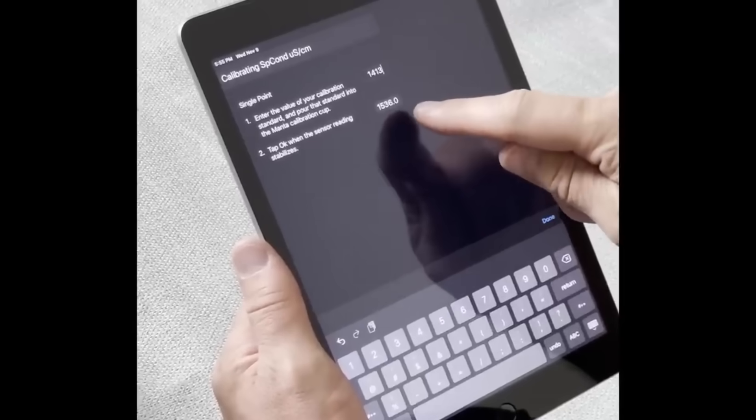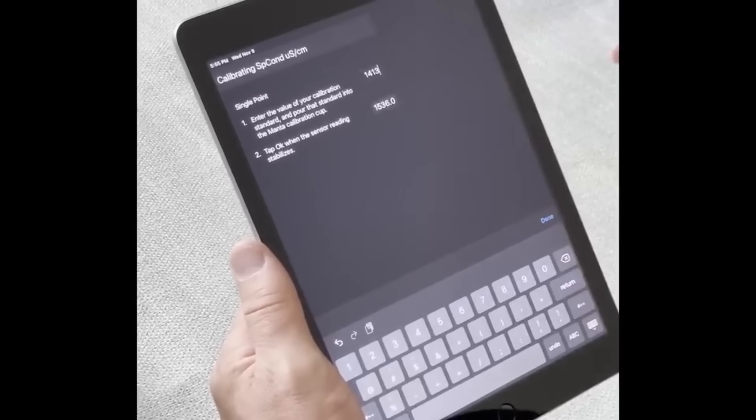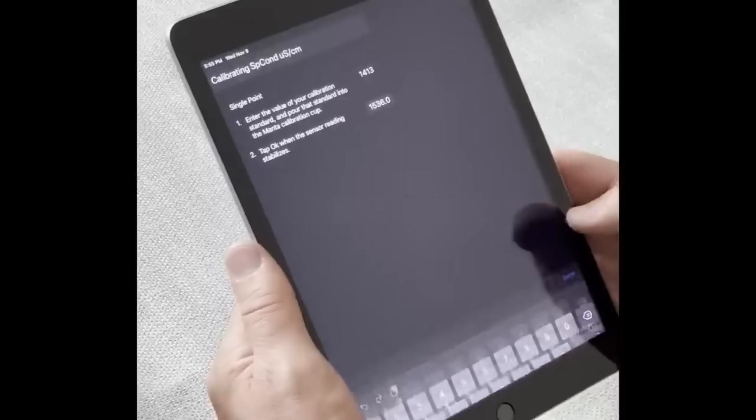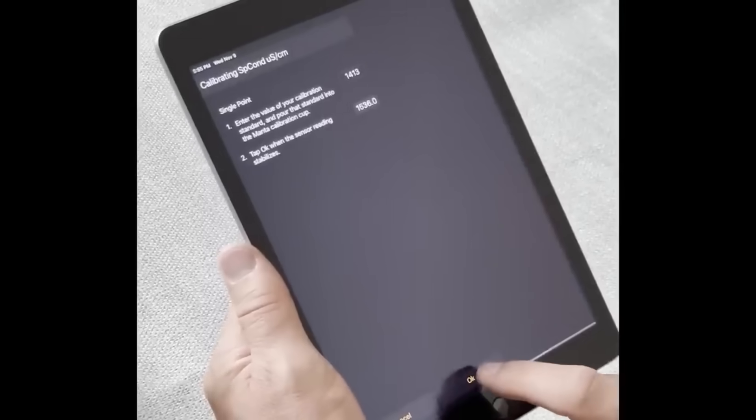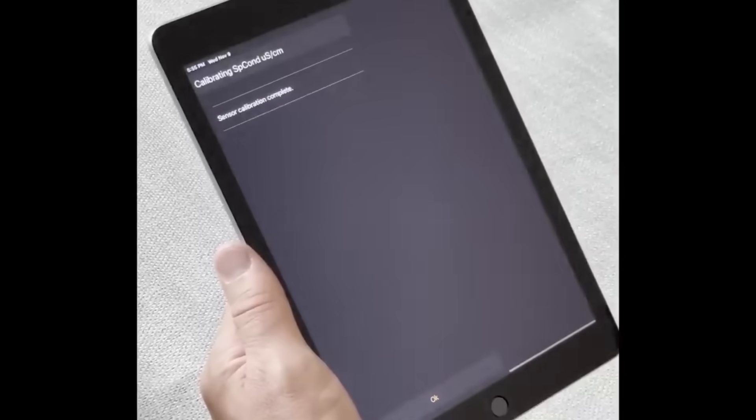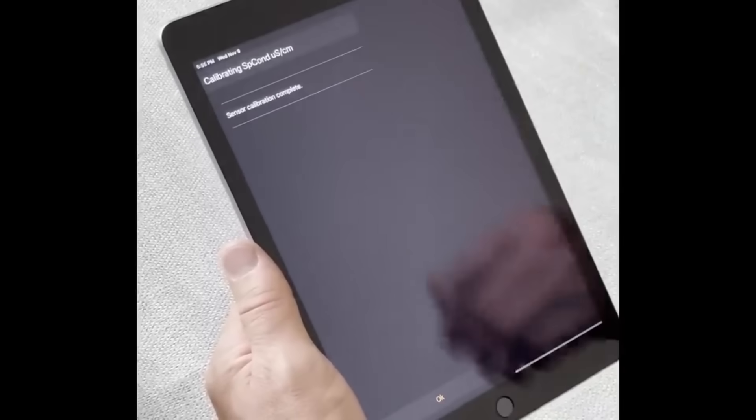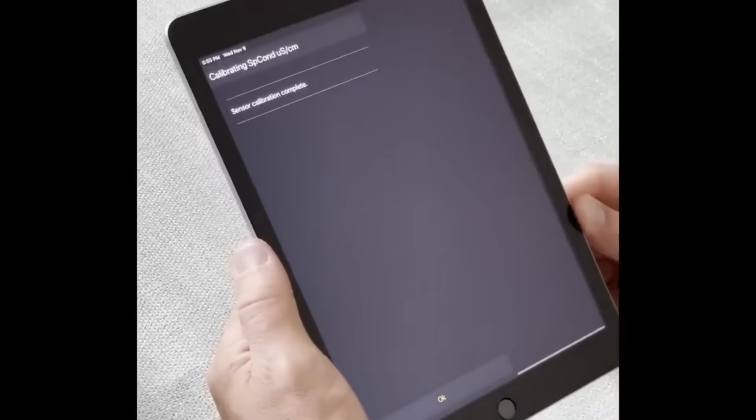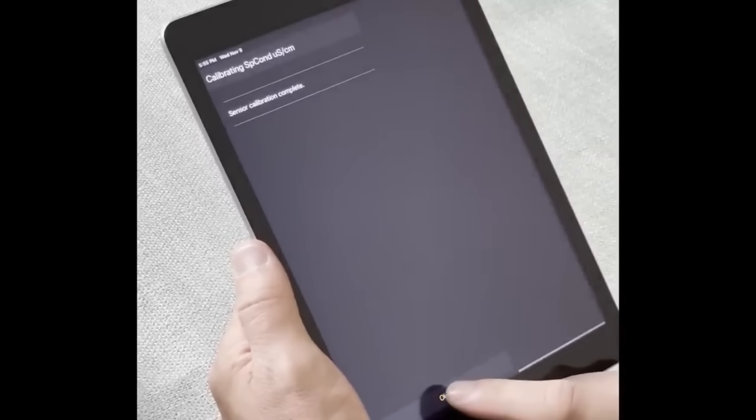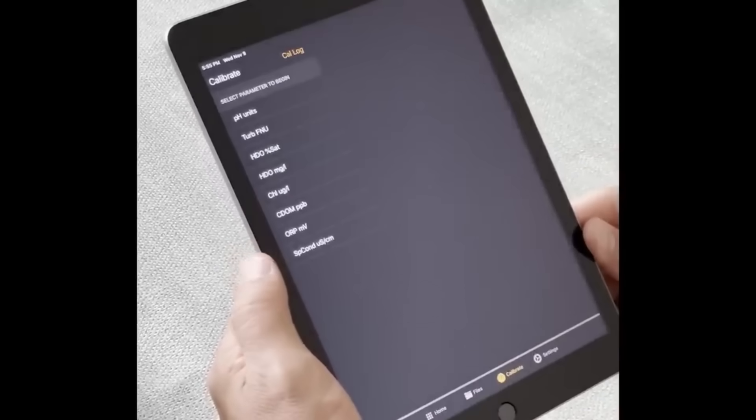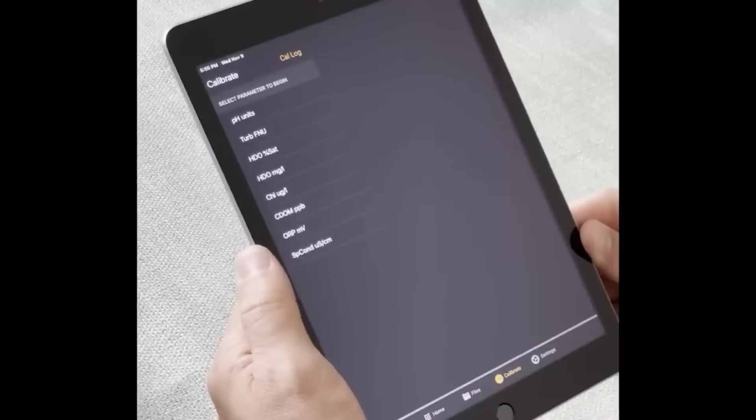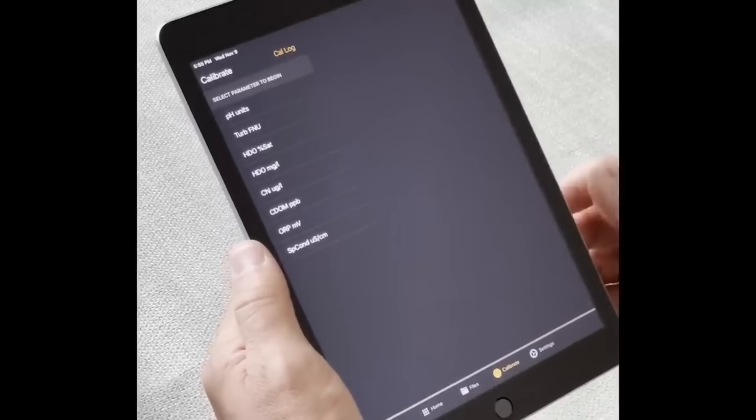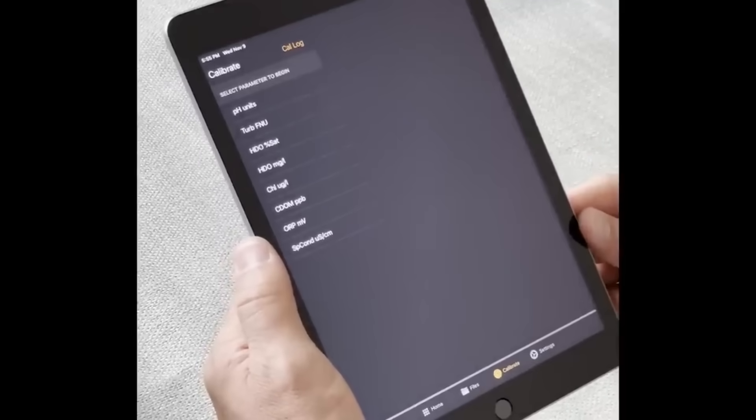Watch the reading and wait for it to stabilize, and then tap OK to continue. You'll see the sensor response factor. Tap OK once again to confirm the calibration, and your conductivity sensor is calibrated.